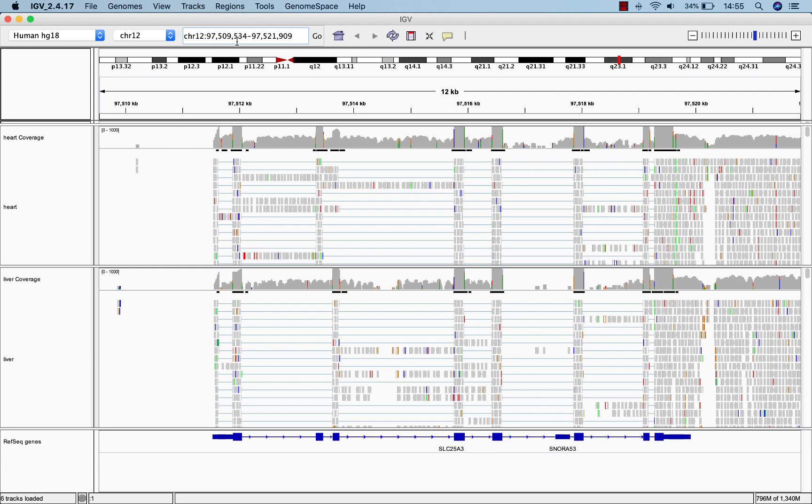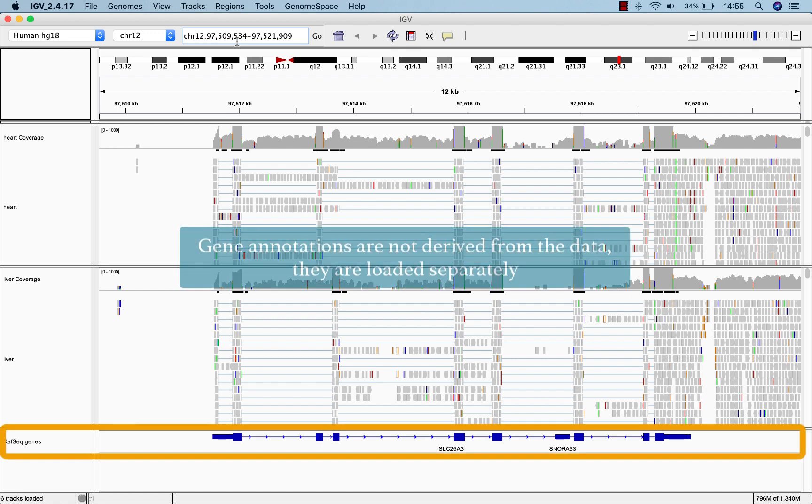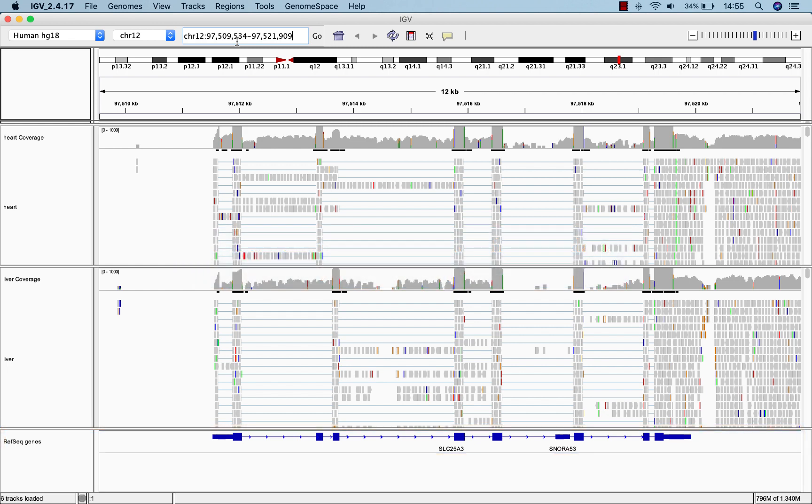Below the data tracks is a gene annotation track. Note that the gene annotations are not derived from the RNA-seq data, but have been loaded separately to help with interpretation of the RNA-seq data.